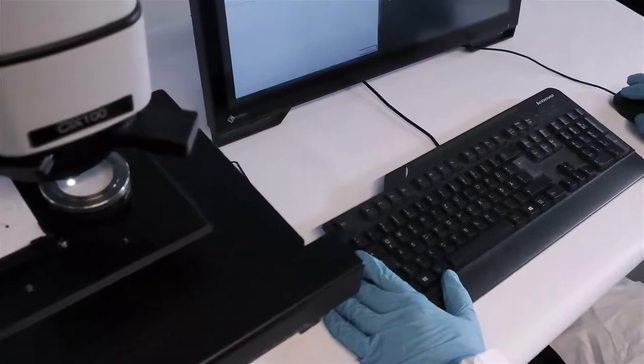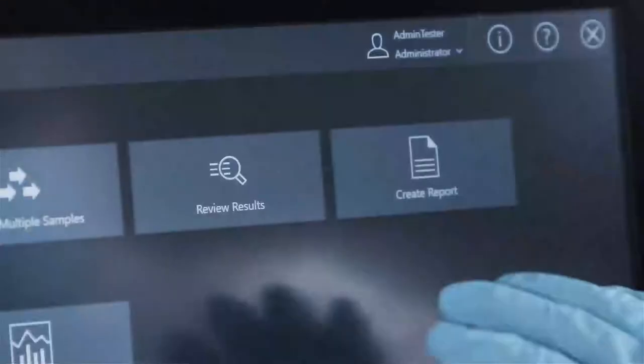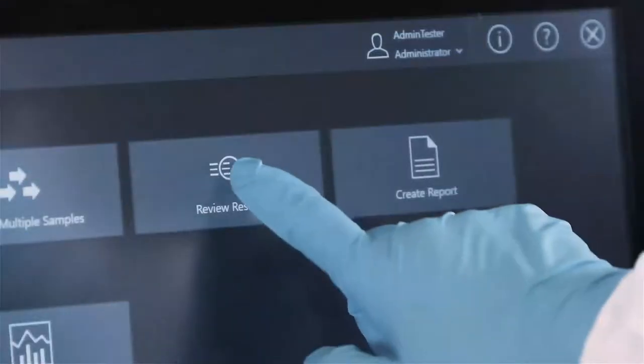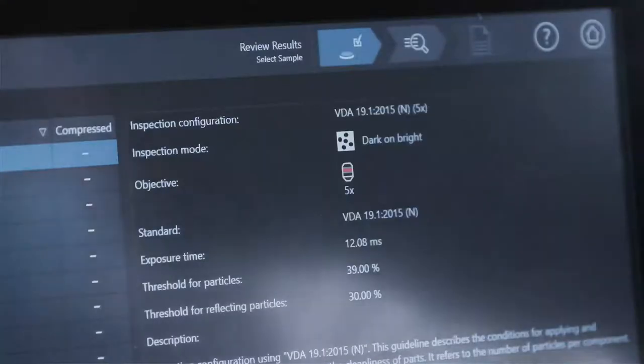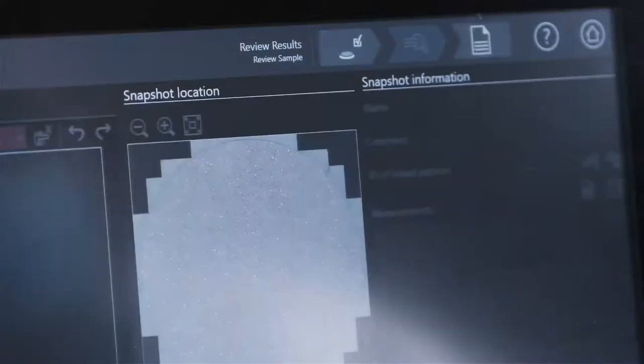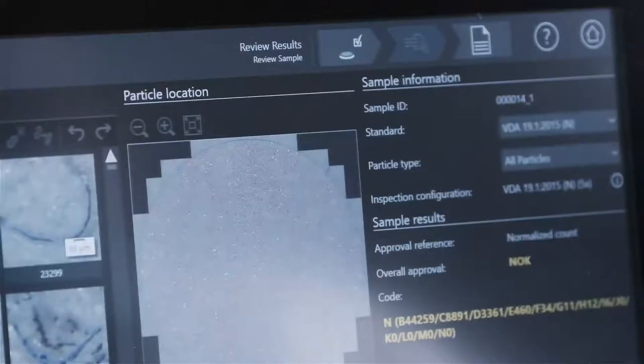The Olympus CIX100 system includes powerful and easy-to-use tools to review the inspection data, both live and from the recorded image.